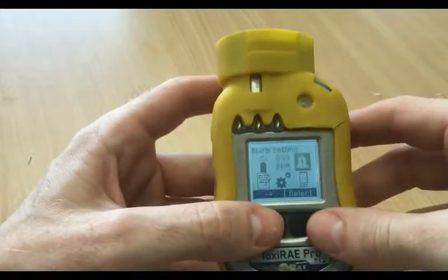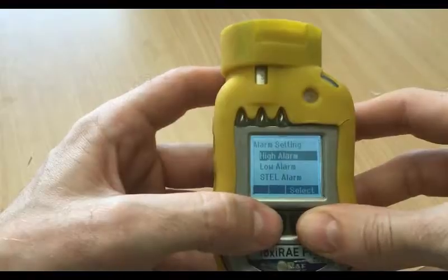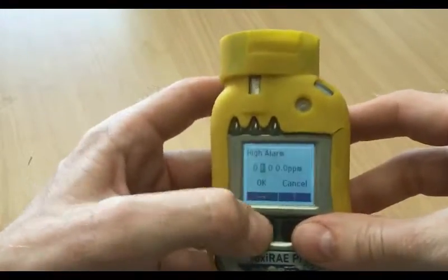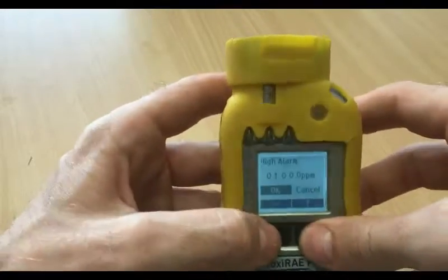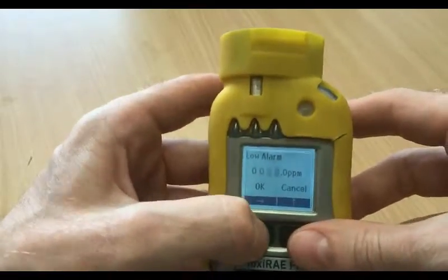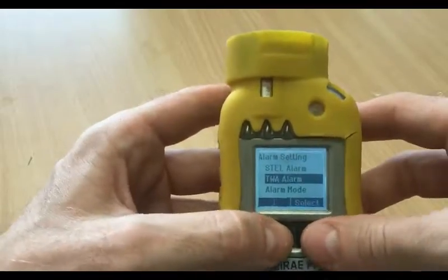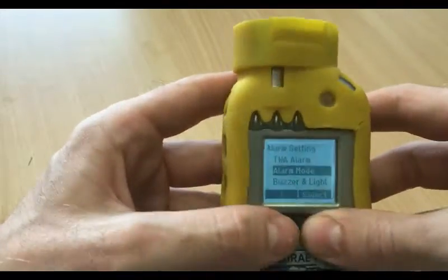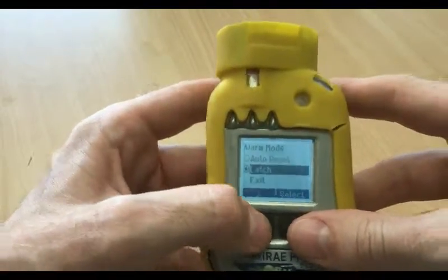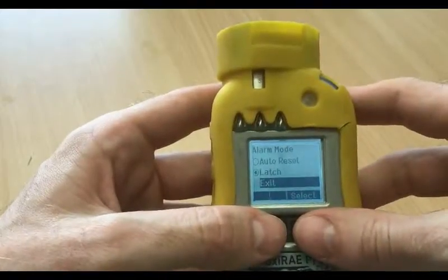Another good thing to check is the alarm settings — just go down and check your high alarm: 100 PPM, which is standard, so it's fine. Check your low alarm: 50 PPM. Check your alarm mode — this is important — make sure it's on latch, so it actually alarms when it detects high levels of volatile organic compounds.